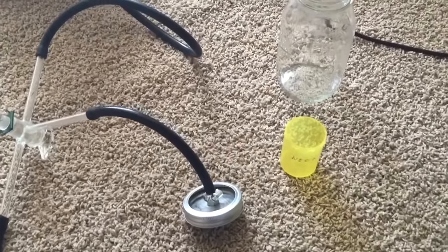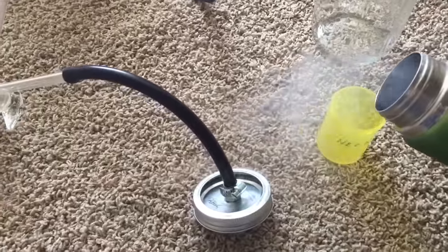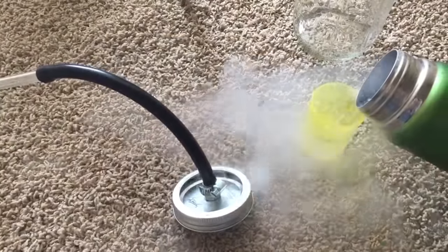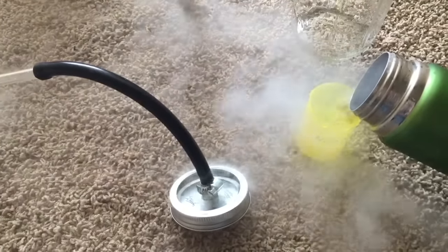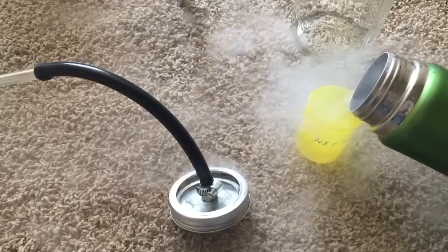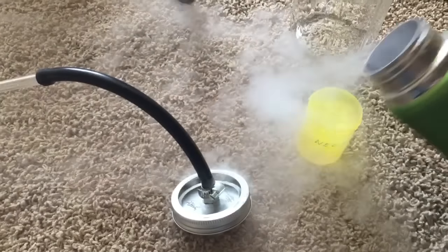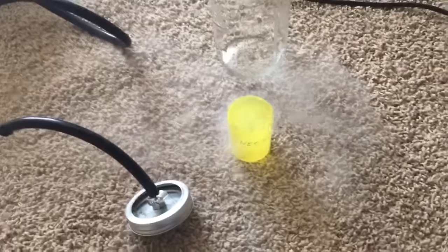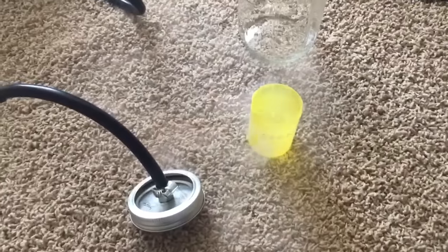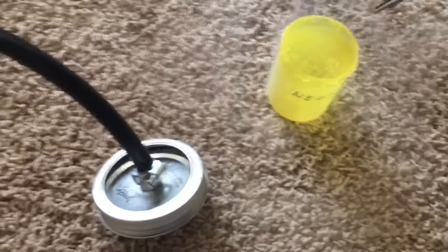First of all, we're going to pour some liquid nitrogen into this plastic container, which is what I'm doing right now. This stuff boils off very rapidly at room temperature. I'm going to fill it up almost to the top and then place it in that jar. I'm putting in excess because it's going to keep boiling off — as you can see there, it's boiling pretty rapidly. Now we're going to place this in the mason jar.